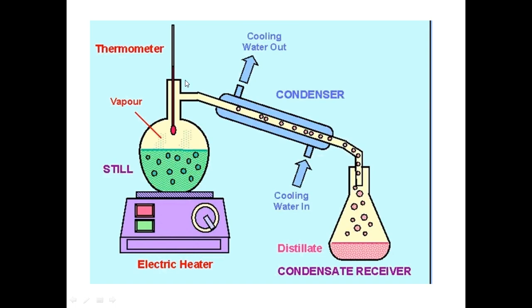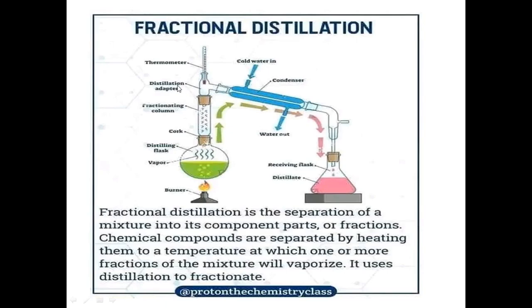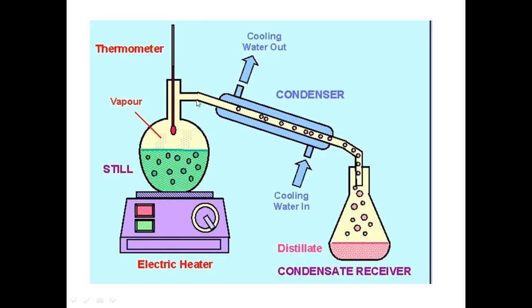Connecting the flask to the condenser is an adapter. So here we have a distillation adapter, which is here. This is a distillation adapter that connects the flask to the condenser in most setups.